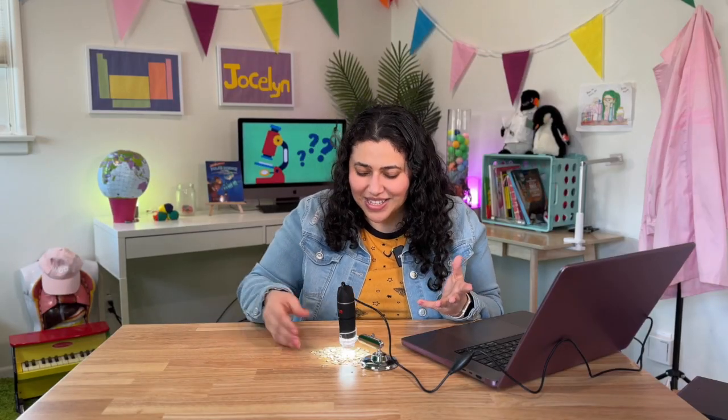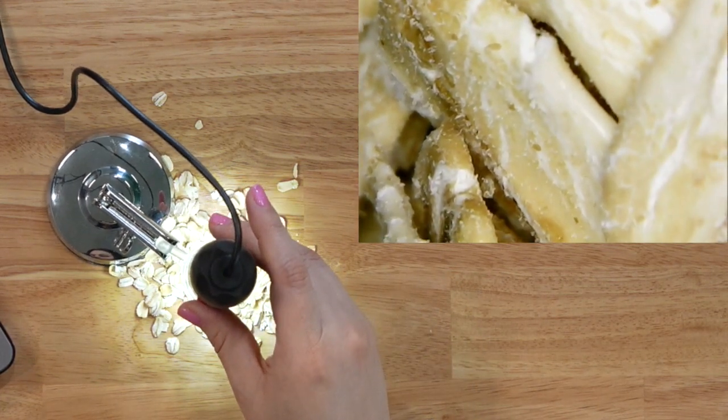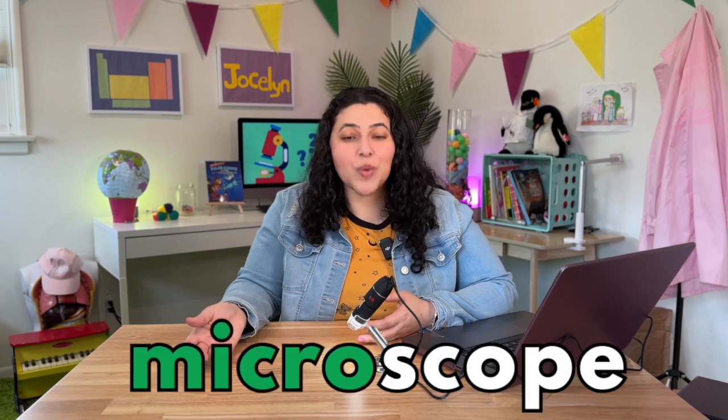Oatmeal. Yeah, I feel like once you know it's oatmeal, it makes a lot of sense because they're dry and flaky, but it looks so interesting up close. A microscope is a tool that helps us see things up close, things we can't see with just our eyes. Its definition is even in the name. Micro means very small.